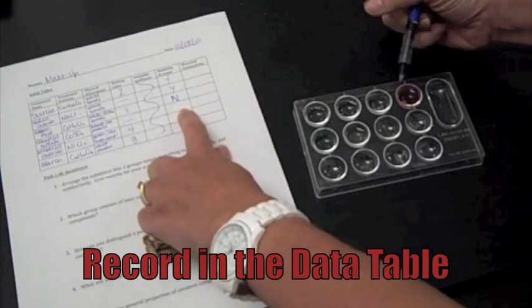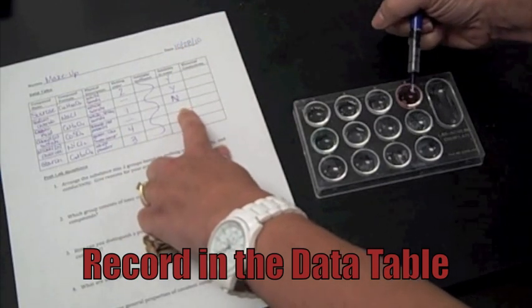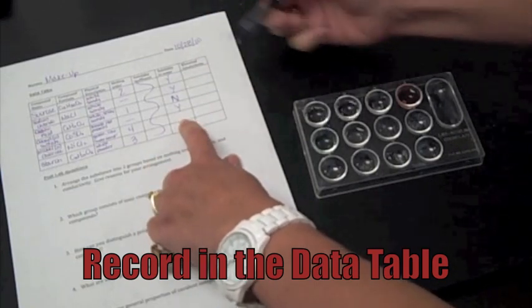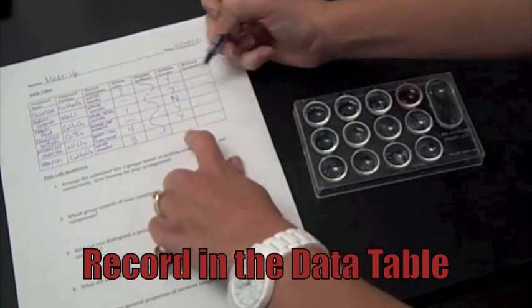The cobalt sulfate, obviously, I now have pink water, so it dissolved. The nickel chloride dissolved as soon as I added water to it, so it's very soluble.